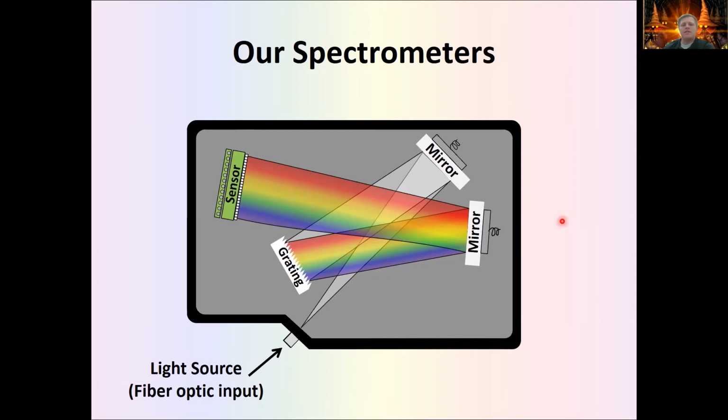All right, so that is fundamentally how a spectrophotometer works. And then this sensor just has some electronic components we won't get into very much that convert that signal, or the current of electrons flowing off of that, into something a computer can read. But that is fundamentally how a spectrophotometer works.